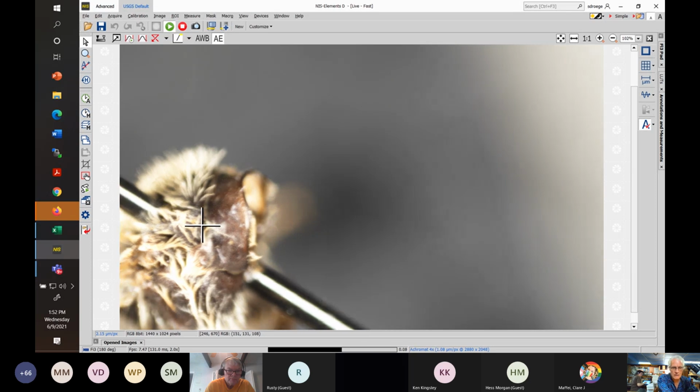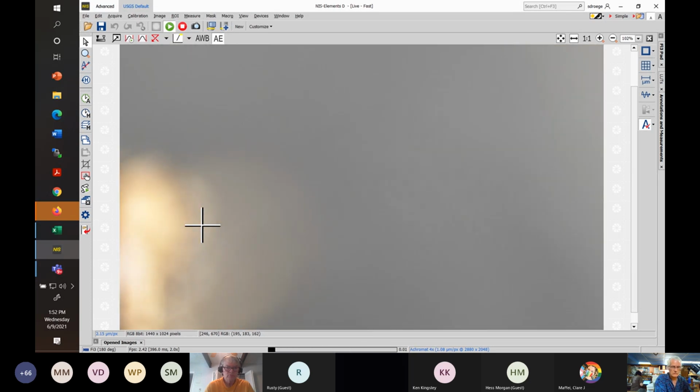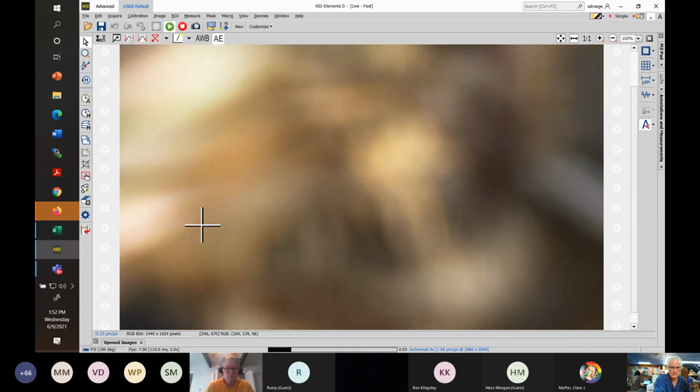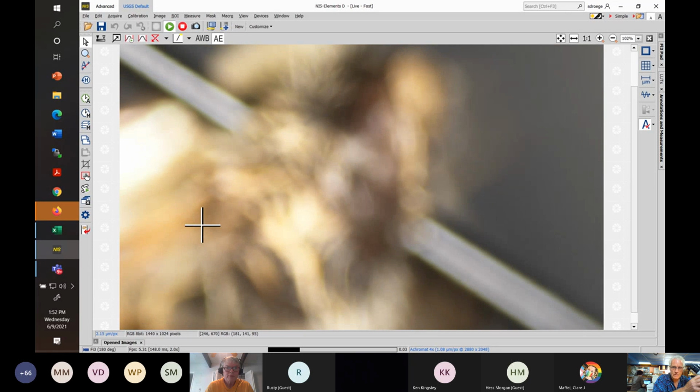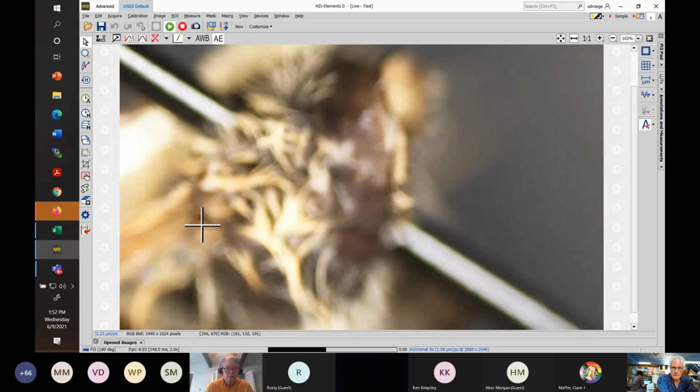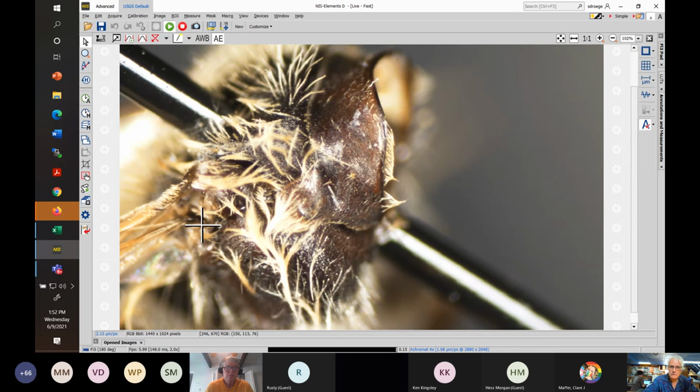That hair is in the way, so I might shift it to the other side also. But there are no little ears, corners, whatever different people call them, going on. So this is a pretty good shot. This hair is in the way, but see, this is all smooth, whereas this would be curved in. There'd be a projecting curve as there was in Perplexa, and then you almost always have a ridge running down in this direction. This is that horse collar look. So everything is smoothly rounded over, however you want to describe it.